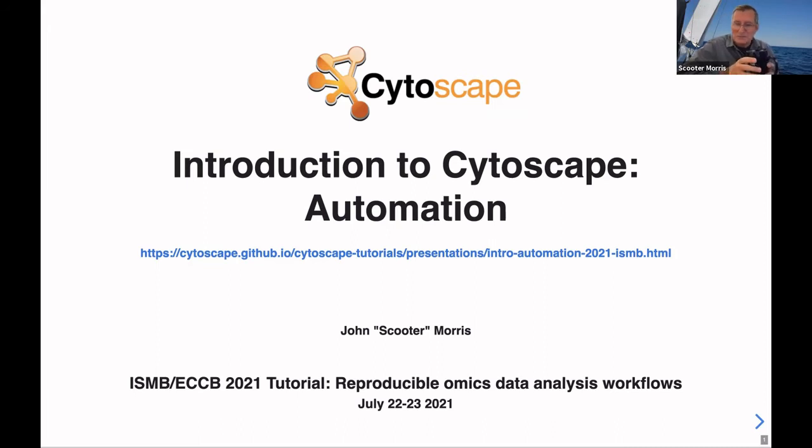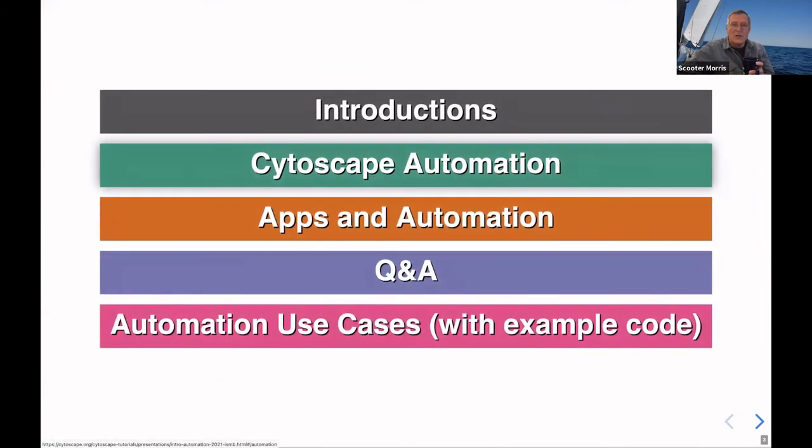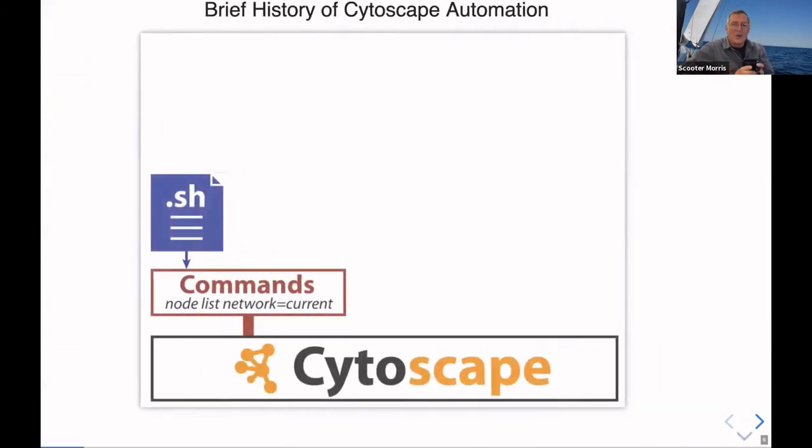Okay, so let's dive into automation. The first thing that we want to do here is get a brief overview of how we got here.